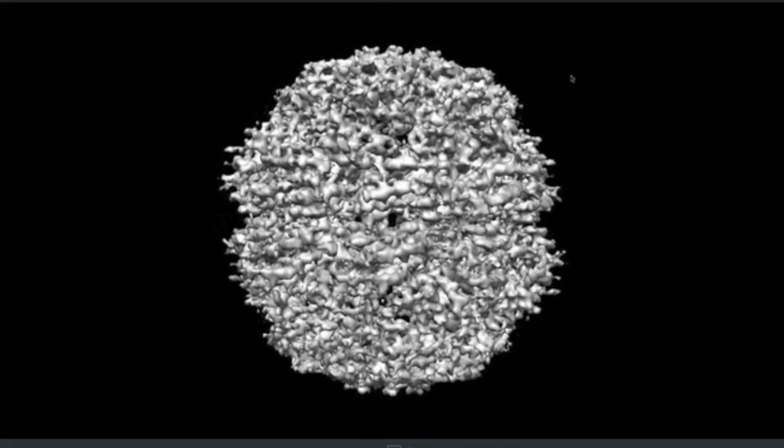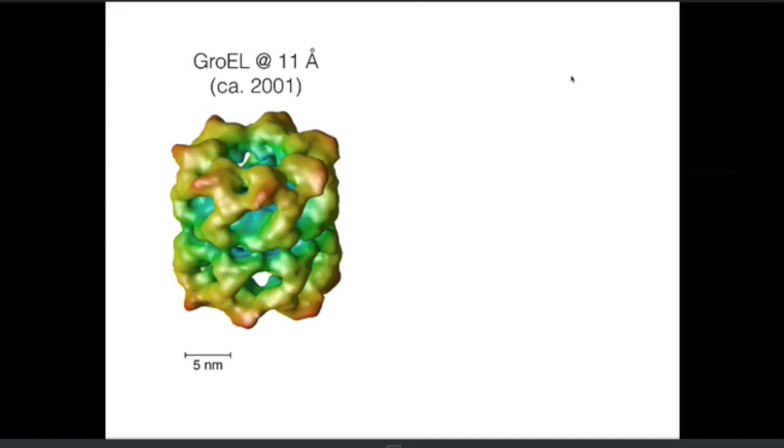For many years in the cryo-EM field, the first 3 decades or so of its existence, it was famous for producing structures like this, the so-called blobograms, which are low-resolution structures with high enough resolution to see some of the quaternary features of the molecule of interest. You could maybe dock a crystal structure into it, but you couldn't really directly interpret it in atomistic fashion.